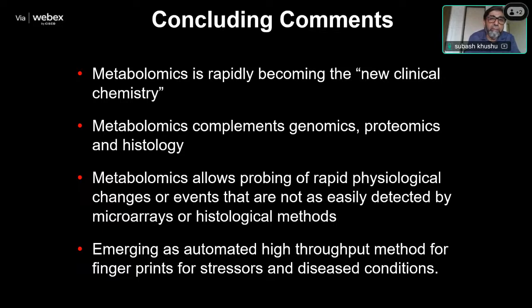Otherwise, the other methods available for radiation sickness measurement are operator based, and they take at least 46 hours for one sample to diagnose. So here is a method which is high throughput, easy to use, and fairly automated. You don't need an operator to look at histopathological slides or anything else. So it is a very fast upcoming technique in medical diagnosis and medical research.